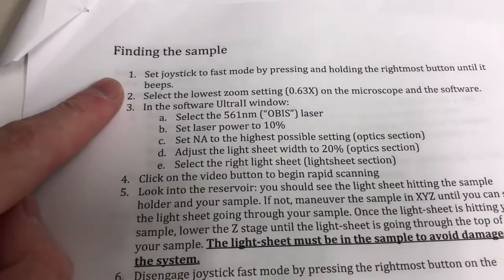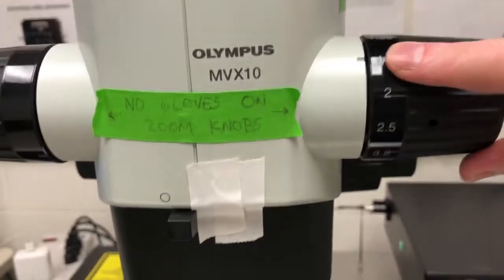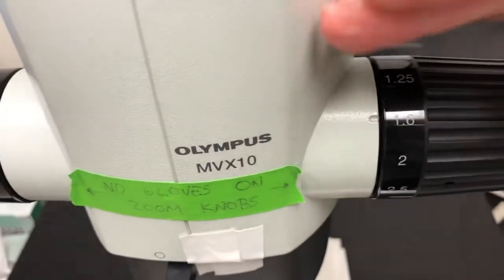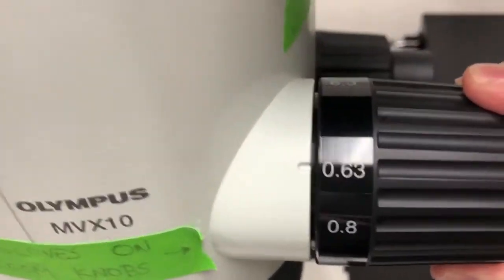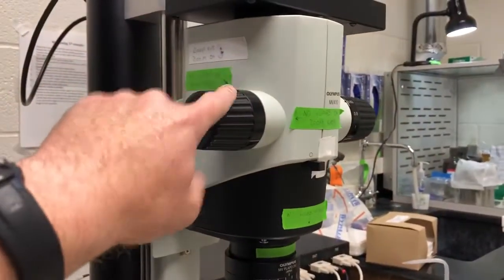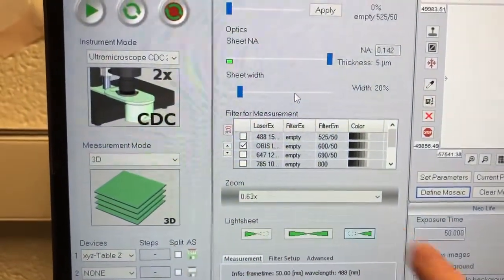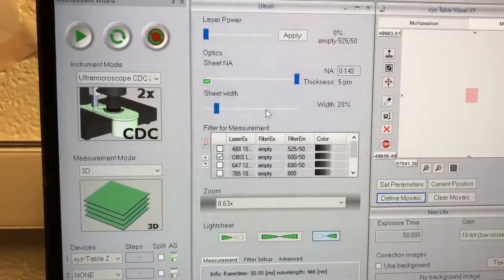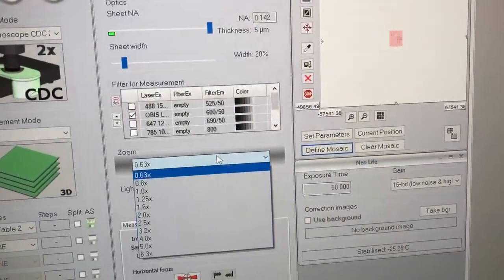Step two: select the lowest zoom setting, which is 0.63, on both the microscope and the software. On the microscope, the zoom setting is here — whatever number is next to that little notch. I need to set it to 0.63. The software has no connection to the microscope, so it doesn't know the zoom setting. We need to tell it in this section of the software. We've made 0.63 the default on purpose, but you still need to check and make sure it's not set to one of the many other options.